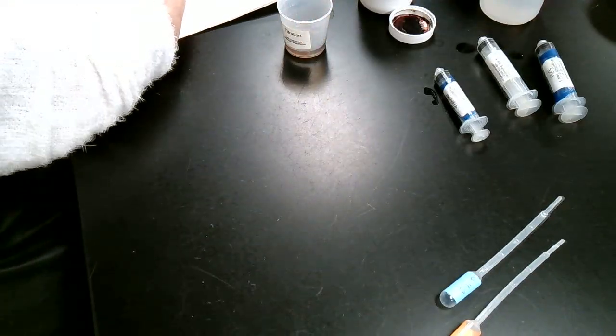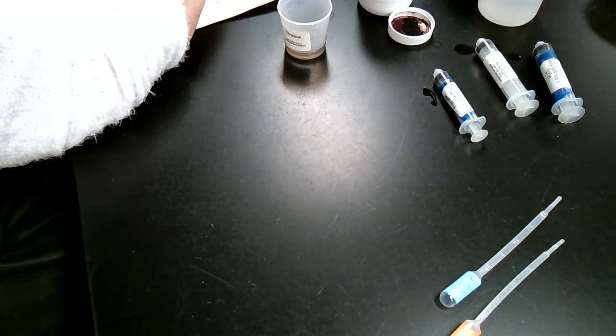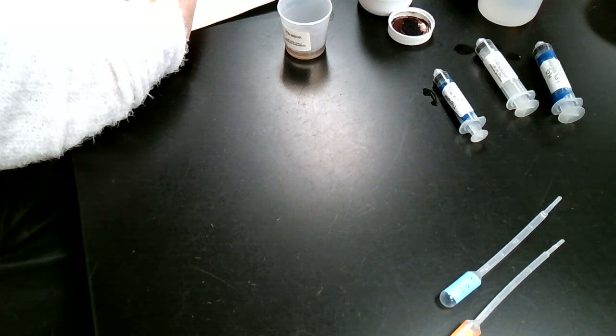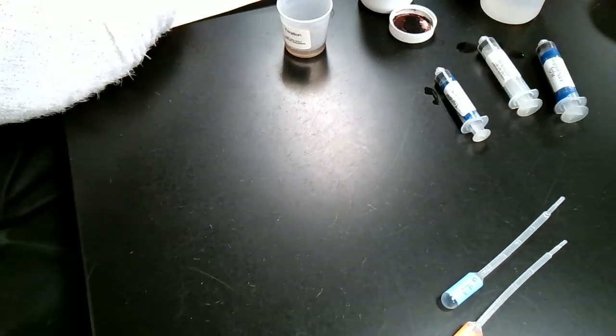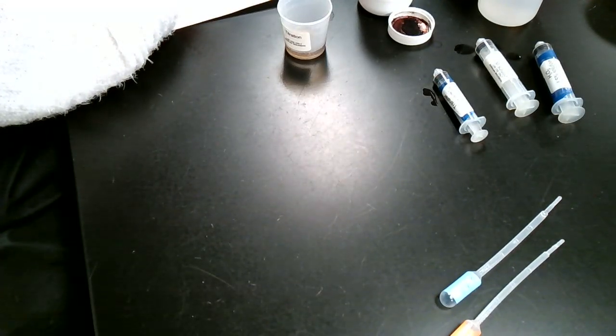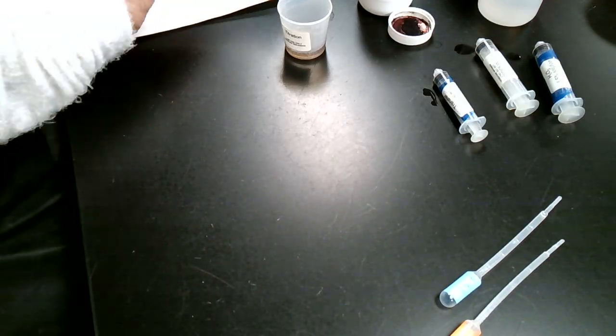I'm going to wash this out, so I'm going to stick it in the wash water, suck up some things, throw it in there. Okay, and you can see the beautiful purple color. Okay, that's when it's diluted, because that's mostly water. Oh, come on. This doesn't want to cool up right now. Okay, there we go. Wash that out as best as you can. Always good to wash these out between every single moment.